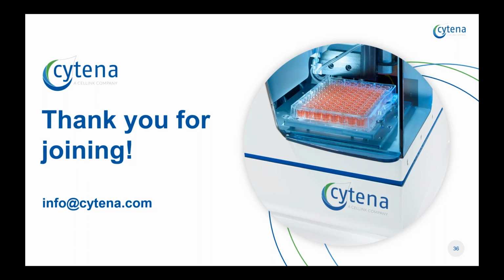How do you specify shape parameters for more complex samples? You might have seen this in the video of the software that I showed you. Once you have loaded your sample into the system, you can basically run it through our cartridge without actually dispensing into the wells, and the algorithm will collect a number of objects that are present in the dispensing cartridge, and they will be presented as a dot plot to you, which allows you to set up the right parameters for the cell size or roundness or others.